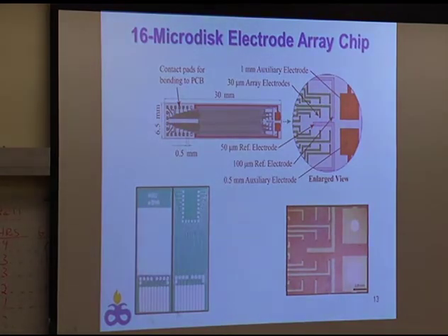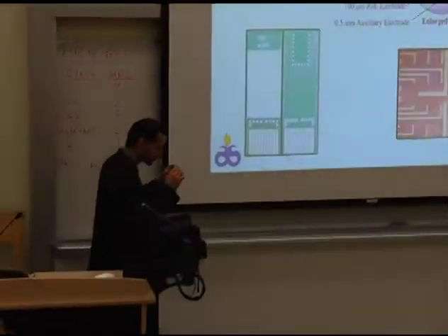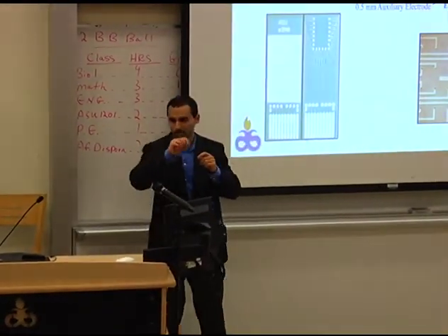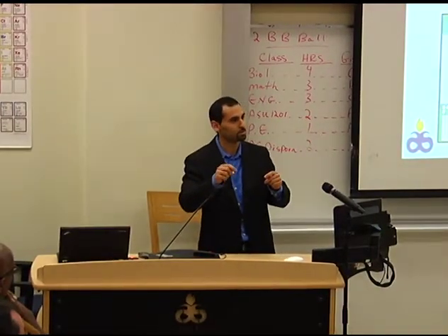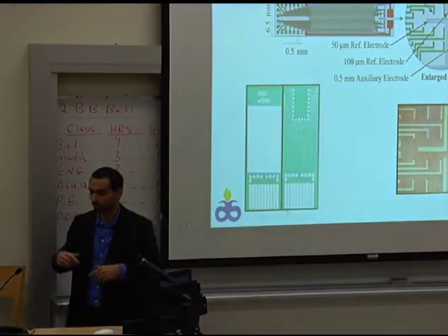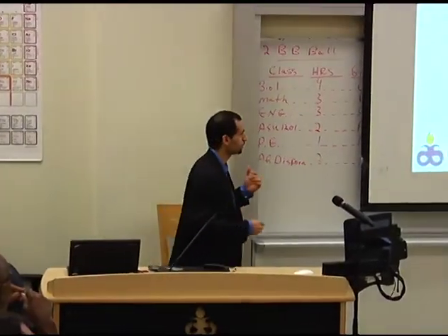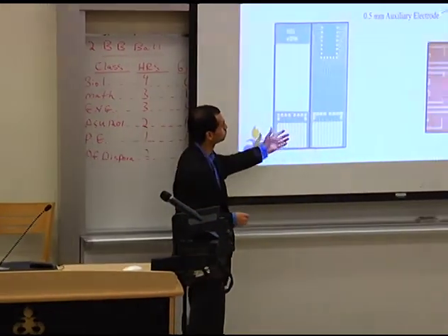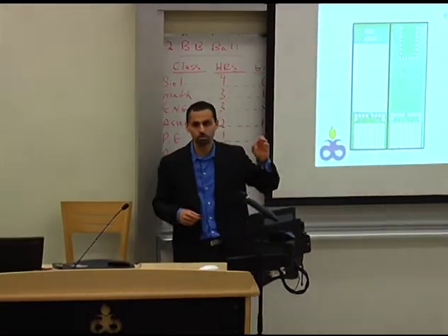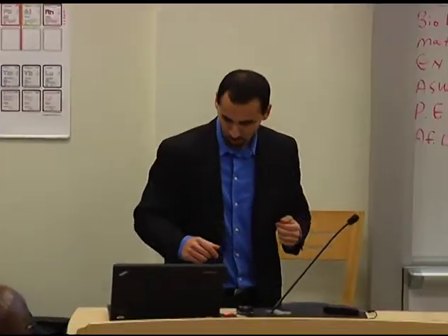I don't have to worry about wire bonding. I don't know if you've heard of wire bonding, but it's very tedious. You have to sit there under a microscope and take micron thickness gold, literally kind of like stitching. You attach it from one pad to another pad. You have to be very precise. If you miss one, you have to melt it off, do it again. Imagine doing that 16 times. It's a big headache. I used to wire bond chips. It would take a good hour or so to do one chip. This, you just align it, heat it up, it's done. It takes maybe 10, 15 minutes minimum work. You don't strain your eyes under a microscope.